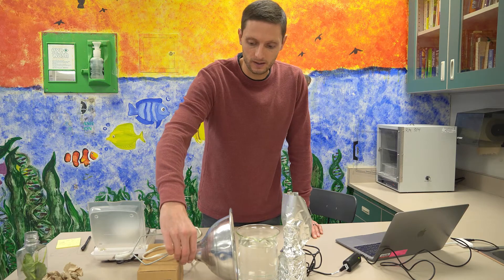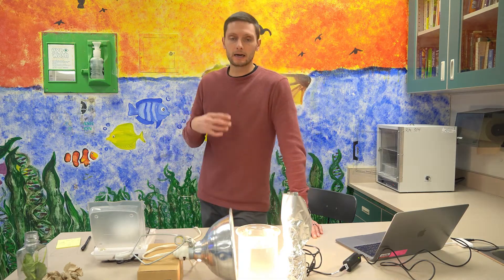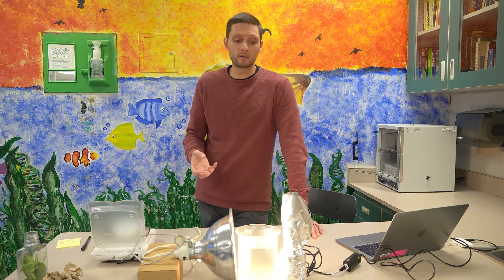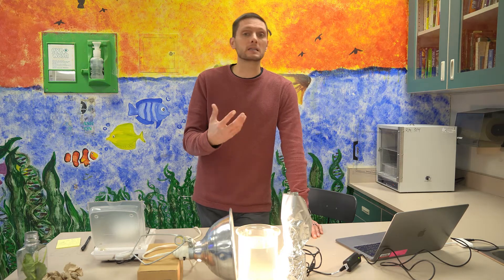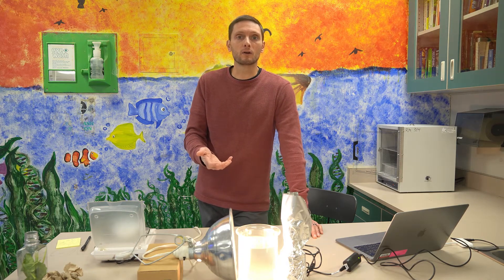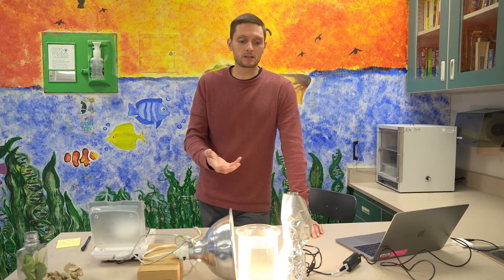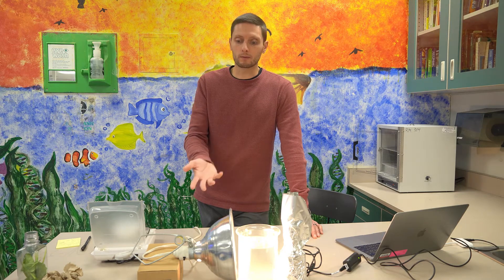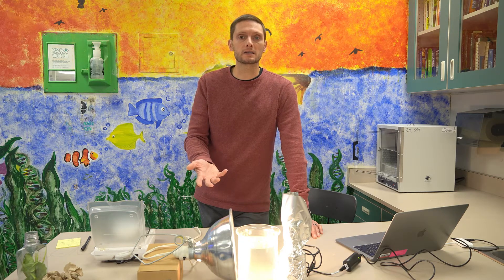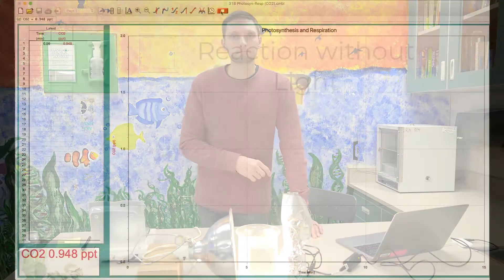So I'll go ahead and turn this light on and we're going to let it sit again for the three minutes. We've got about two minutes left right now, a little over two minutes. So we'll start recording data after that time has passed.